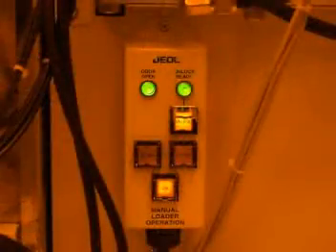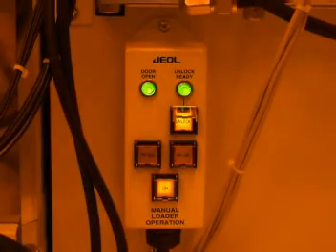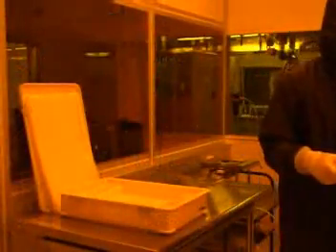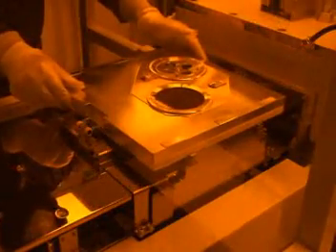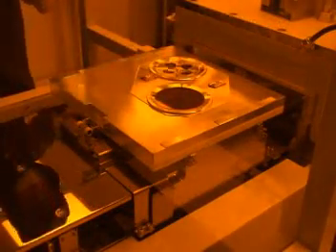Before you can load the cassette into the system, you must first unlock the door to the platform by pressing the unlock button. The button will illuminate once it is unlocked. You should then open the door. The green door open light will come on. Once the door is open, you can load the cassette. Make sure that the cassette is facing wafer side up. Carefully place the cassette onto the platform. Slide the cassette so that the hook on the edge of the cassette is flush against the rollers.